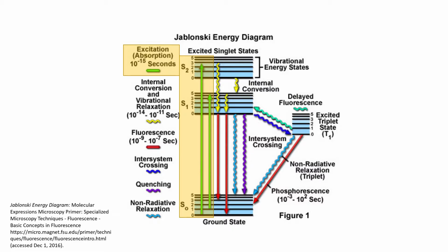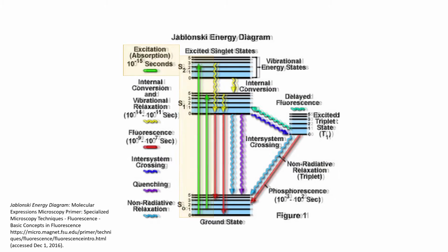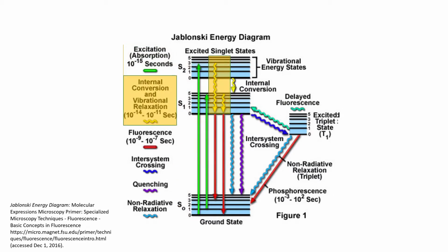The excited states are dependent on each particular molecule. Similarly, each fluorophore has a specific excitation wavelength that can be measured. The second step is the vibrational relaxation of the excited state electron to the lowest energy level. The third step is the emission of the photon at a longer wavelength than it was absorbed. This returns the molecule or the compound back to the ground state.